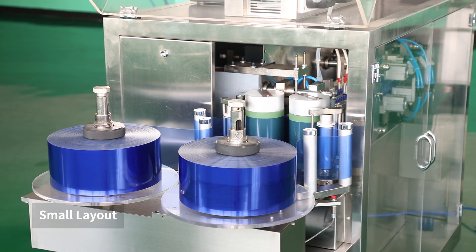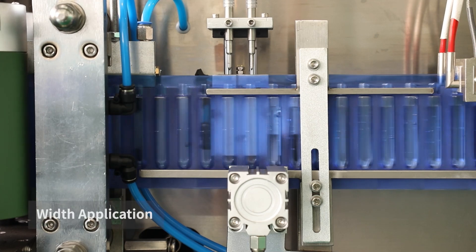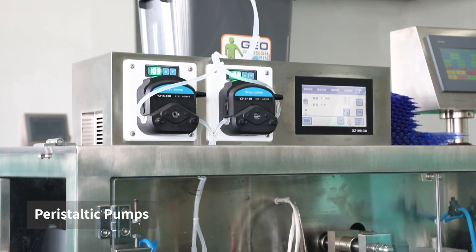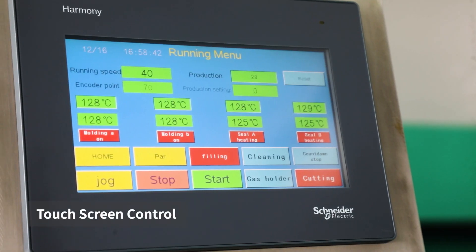DSM120P2 Plastic Ampoule Filling and Sealing Machine has two filling heads. As our basic model, which with a small layout and wide application, likes liquid, paste, oil, sauce, mouthwash, juice pharmaceutical, etc.